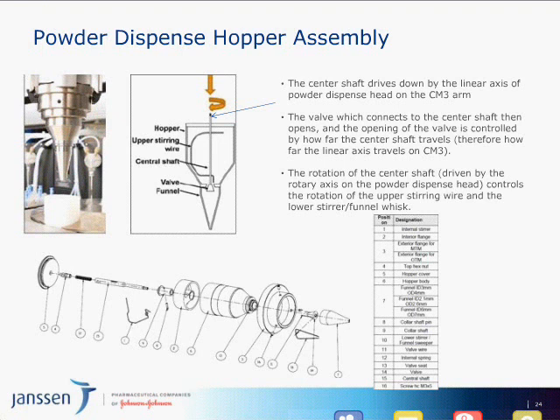If we use the same dispensing parameters, we hope that this approach will give us a feeling of how well or how poorly the powder flows. If the powder flowability is good, we will see a very steep dispensing curve. If the powder flowability is poor, then the dispensing curve will be flat.